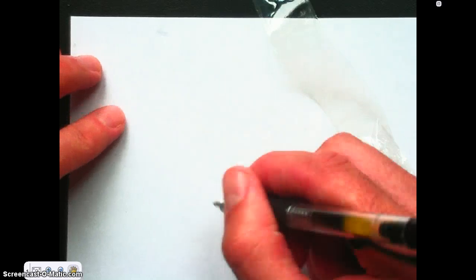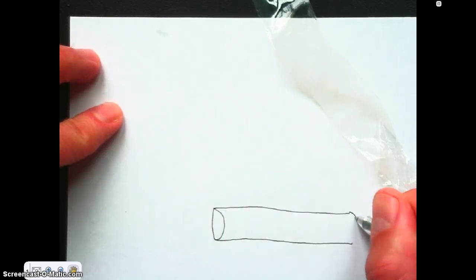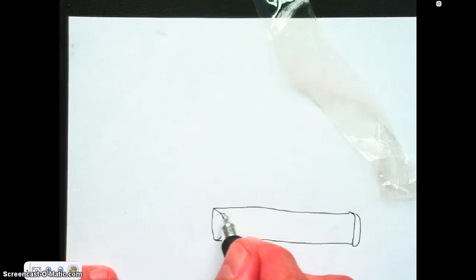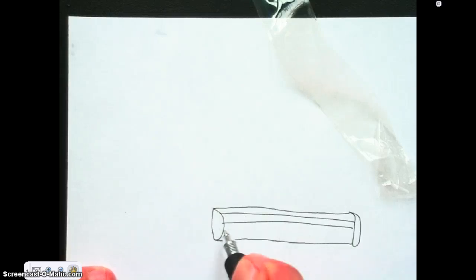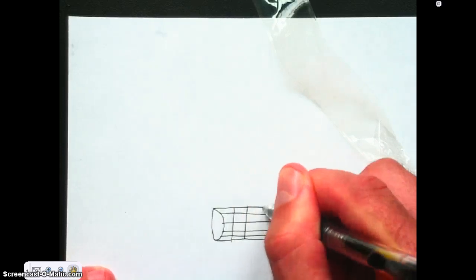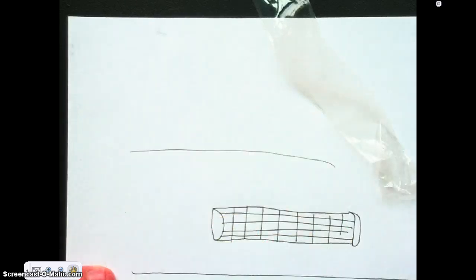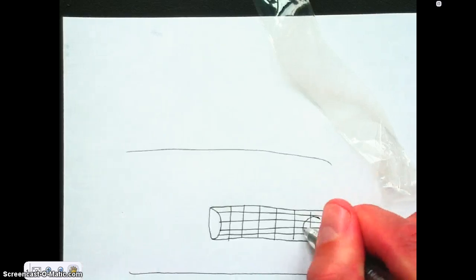What this dialysis tubing does is, its real world purpose was for the process of dialysis, which some of you may know somebody whose kidneys no longer function. Their blood is fed through this tubing, and the tubing, just like the cell membrane, is selectively permeable. What we mean by that is that the holes at a microscopic level, and even a sandwich bag has these microscopic holes, are so small that when this is bathed in a solution of water, we'll pretend like this is water surrounding it, the red blood cells are too big to get out of these holes.